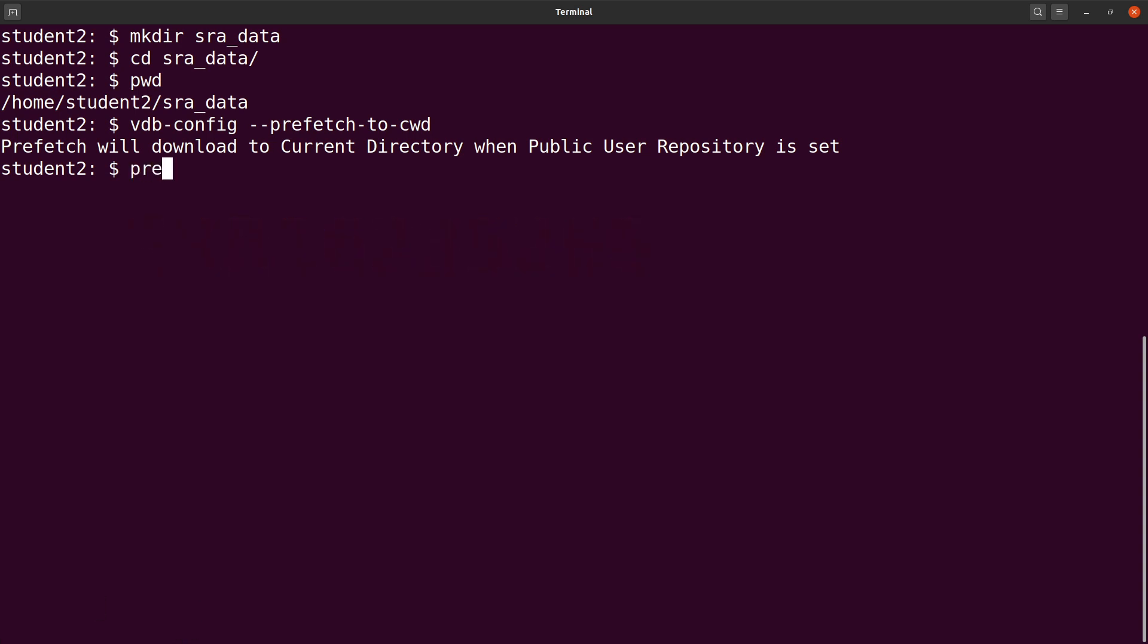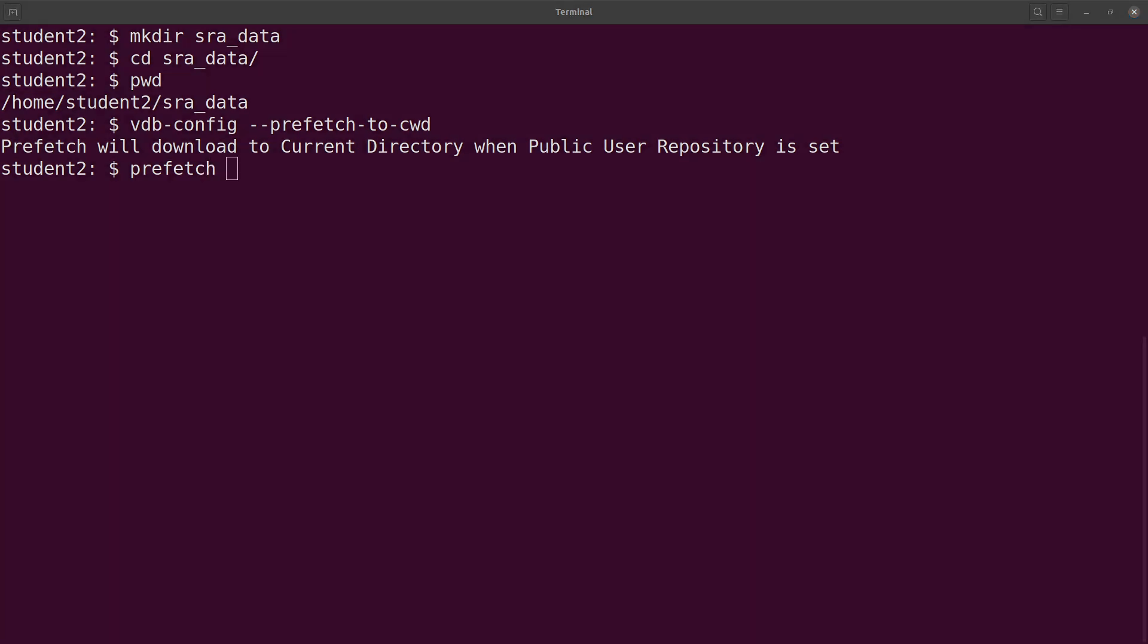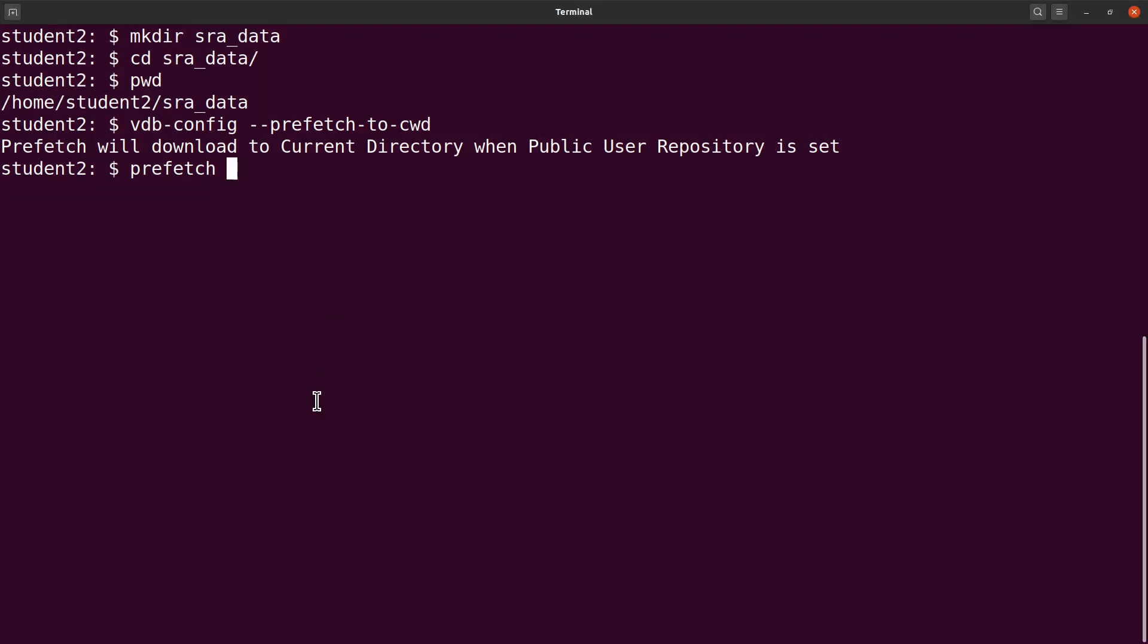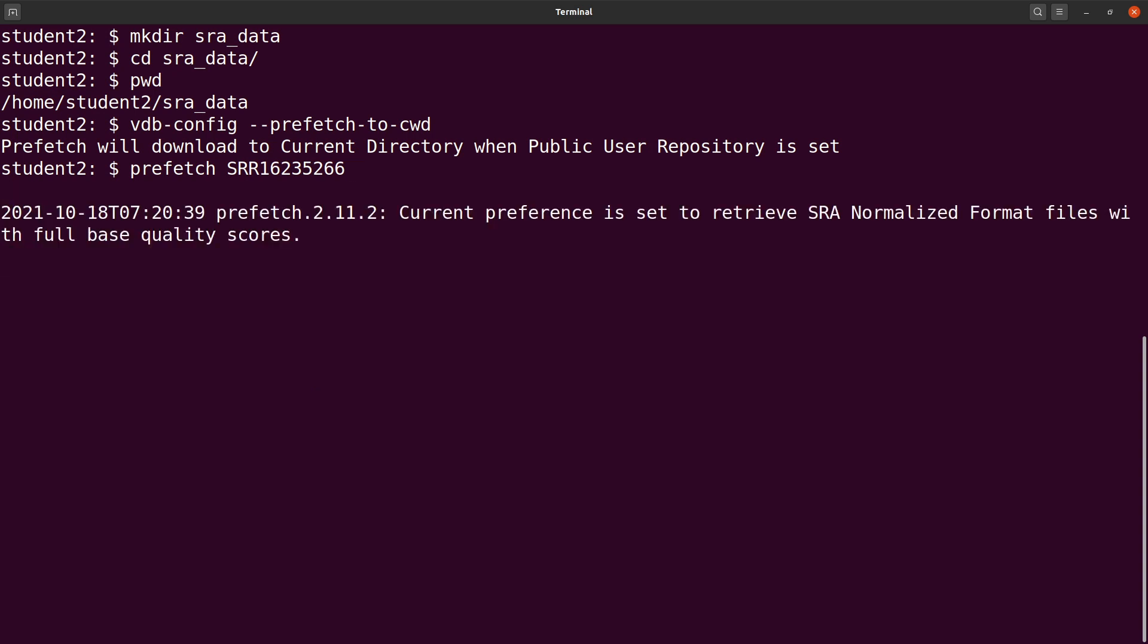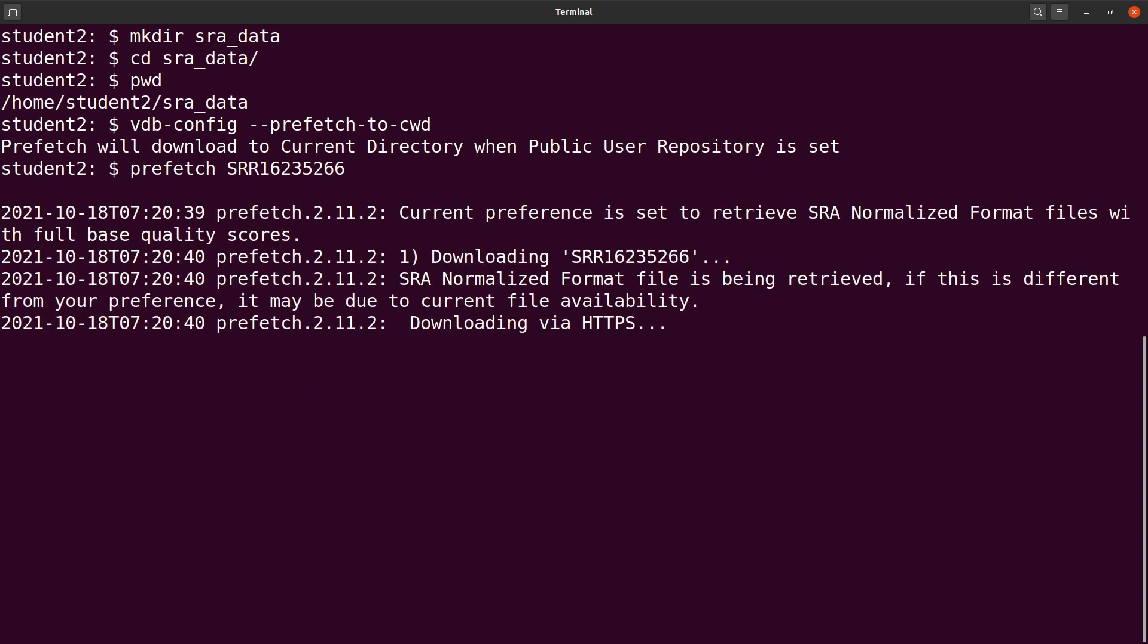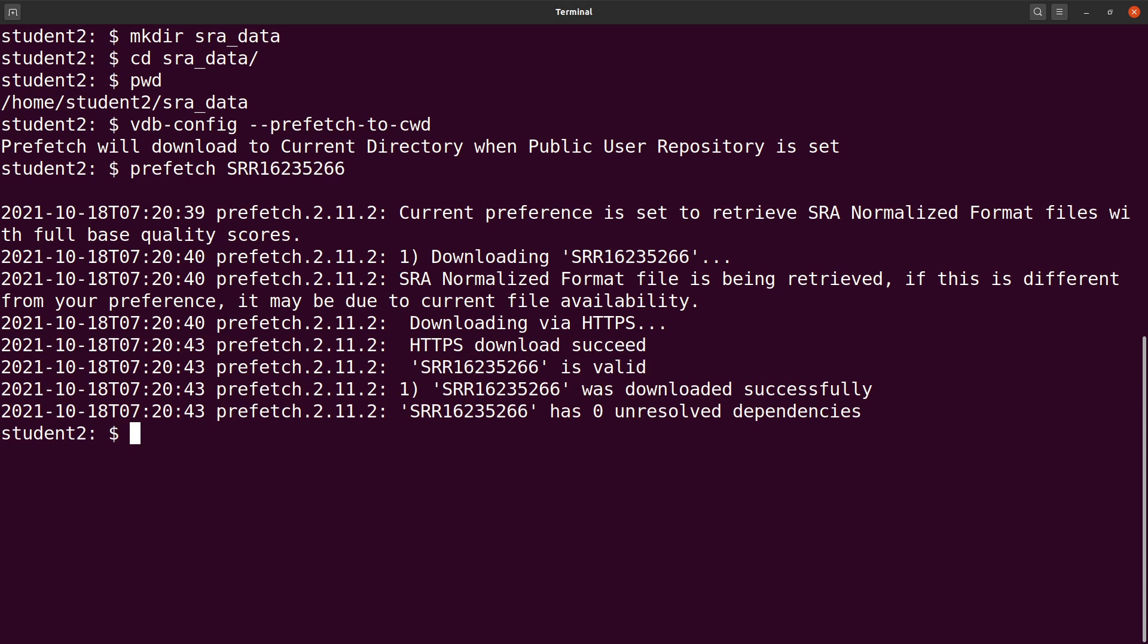So I say prefetch and then I indicate that accession number. So there's a single-length read, so I have it there. I run and then let's prefetch download the SRA files. Here you get the SRA file.